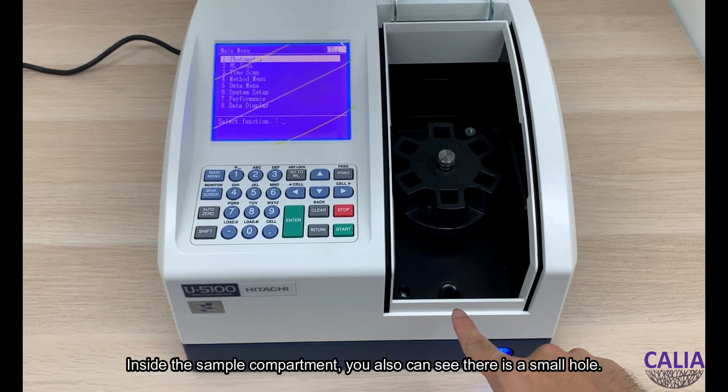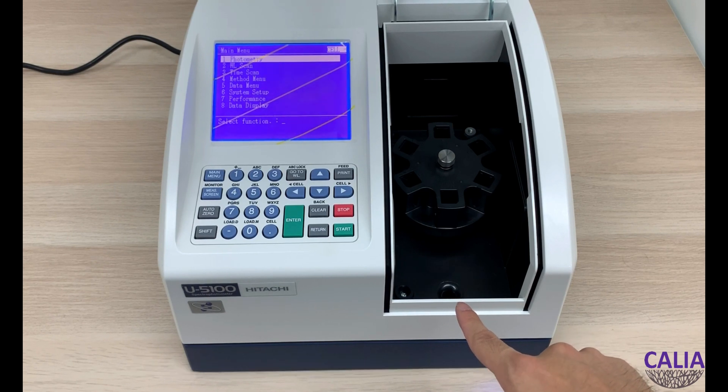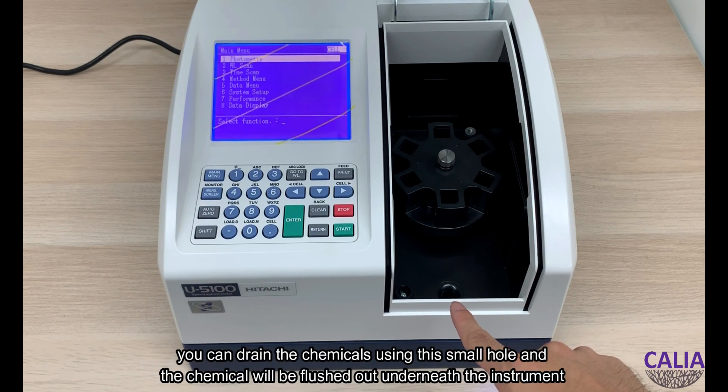Inside the sample compartment, you can see there is a small hole. When you experience chemical spillage in the sample compartment, you can drain the chemicals using this small hole and the chemical will be flushed out from underneath the instrument.